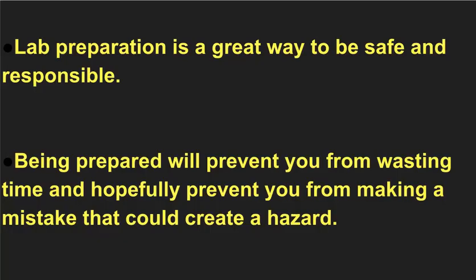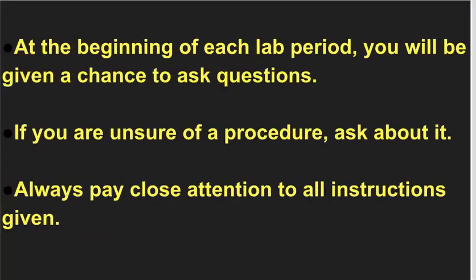Now, other things to think about for our lab specifically is lab preparation is a great way to be safe and be responsible. If you're prepared ahead of time, you're less likely to have an accident. Very few things are accidents. Most of the time it's due to lack of forethought and preparation. I will always do pre-lab information for you to tell you where to get things, how to be safe, what the hazards are, and how to dispose of things that need to be disposed of. Being prepared will prevent you from wasting time and hopefully prevent you from making a mistake that could create a hazard for yourself or others.